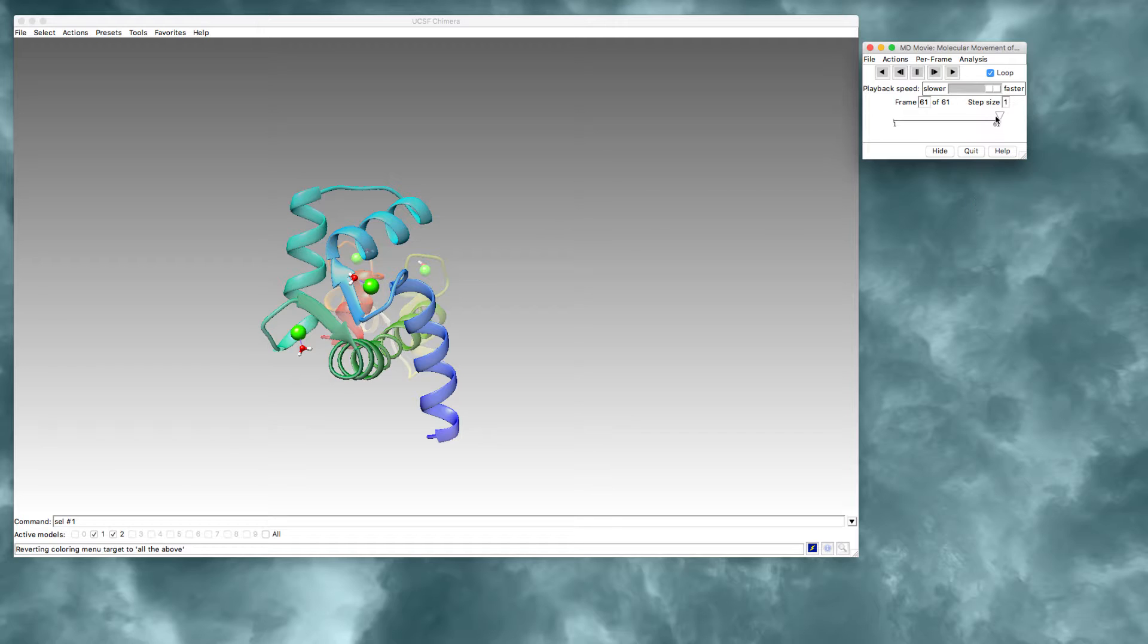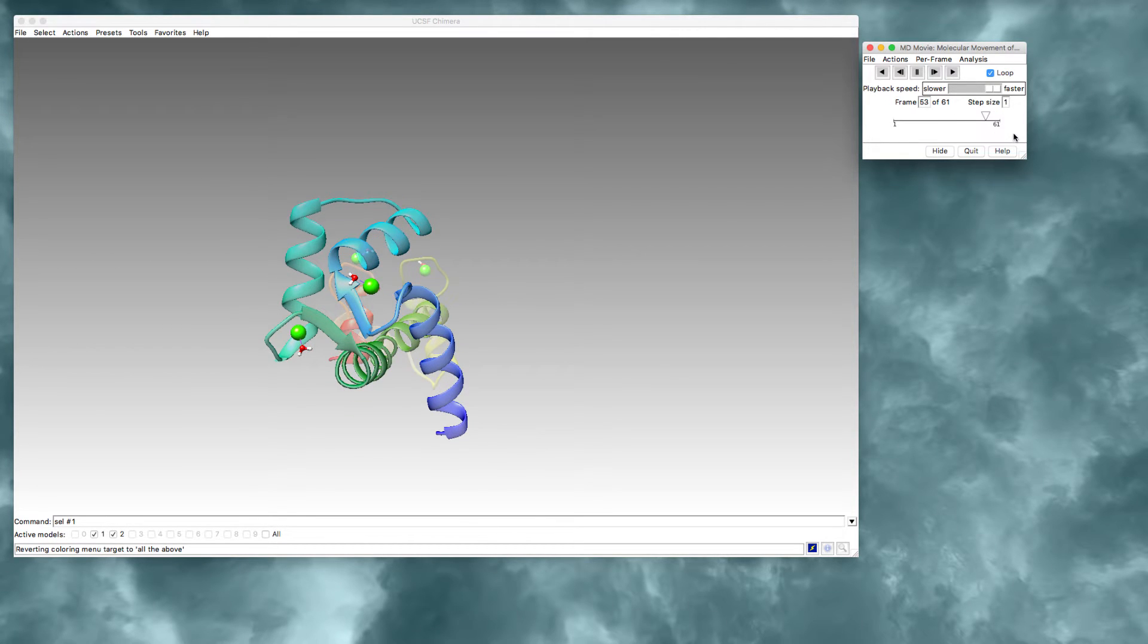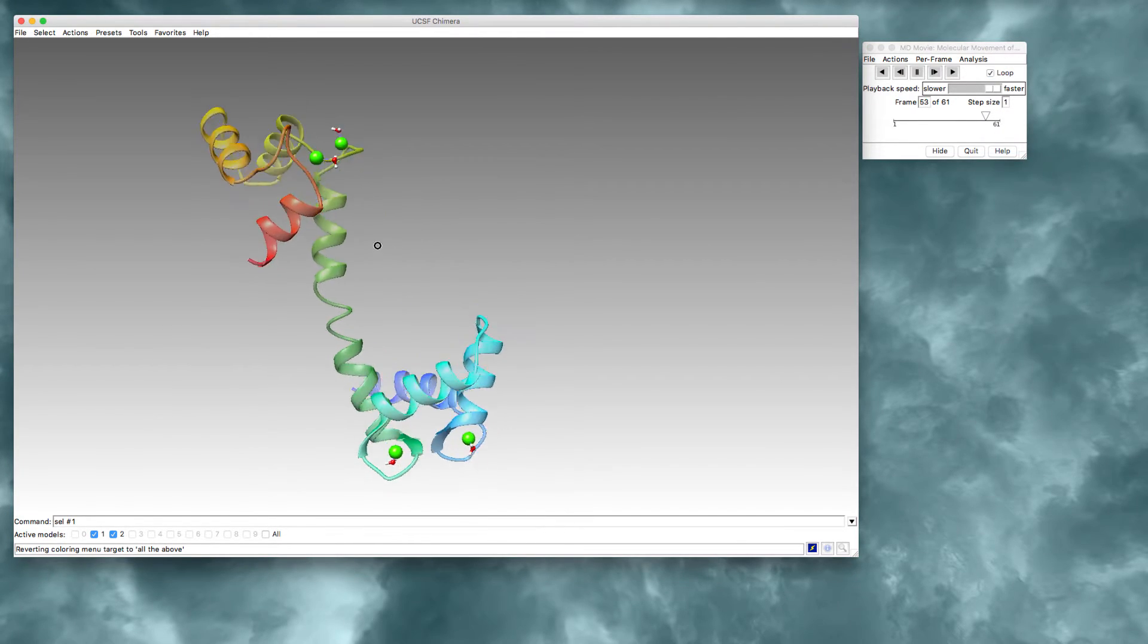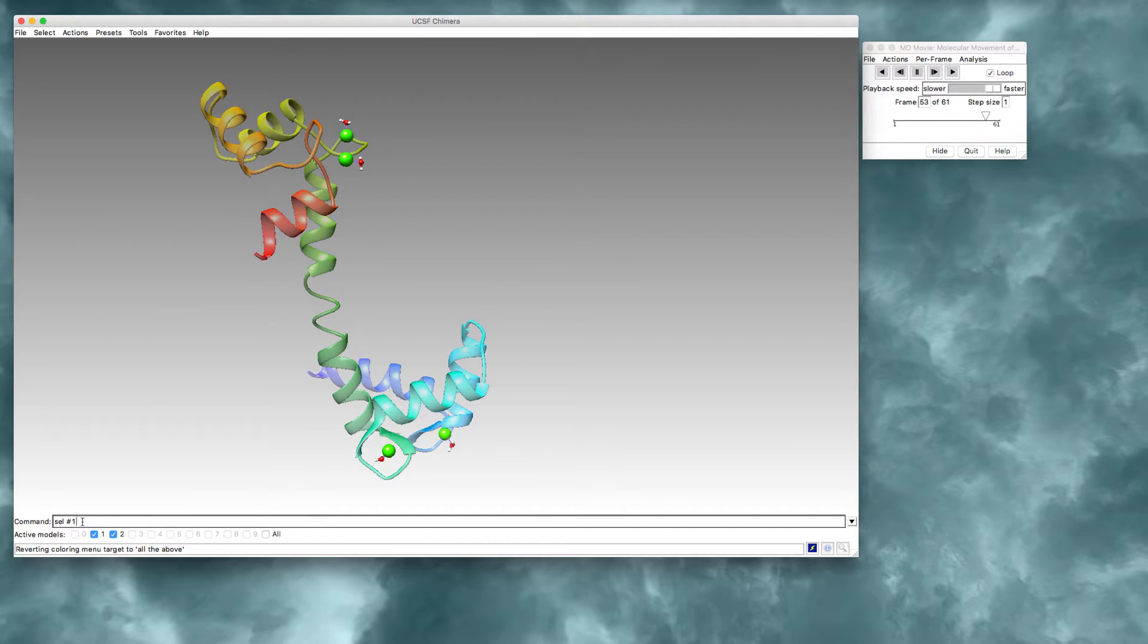I'm going to make sure that I'm in the calcium binding form, so the metal bound form, and I am. And then I'm going to select the calcium ions themselves. So notice that the calcium ions have been selected.